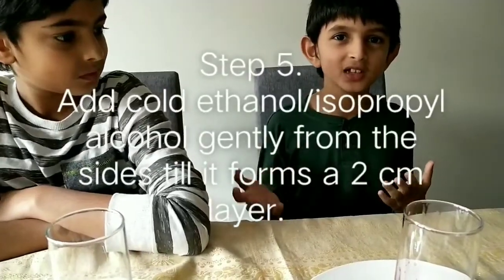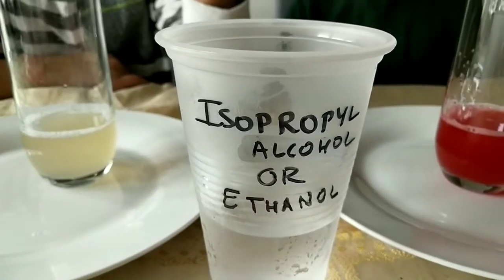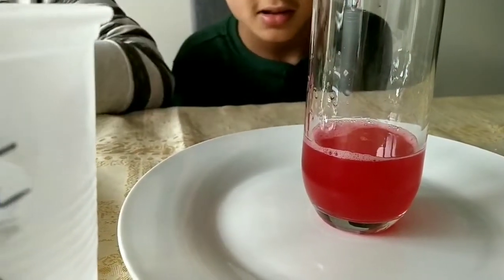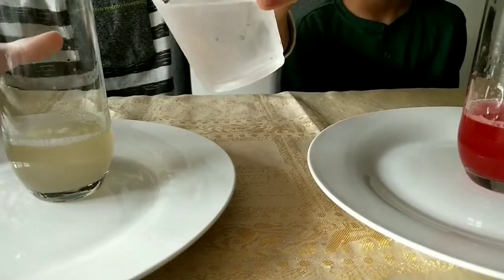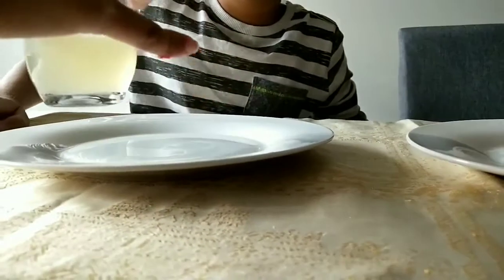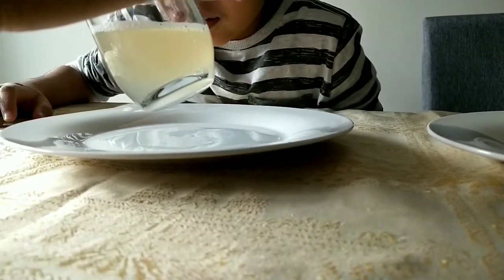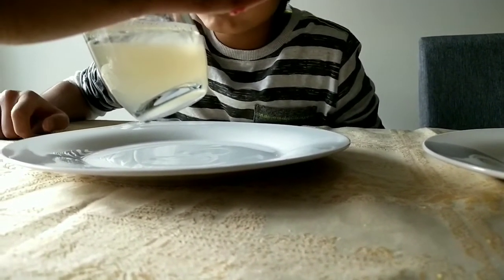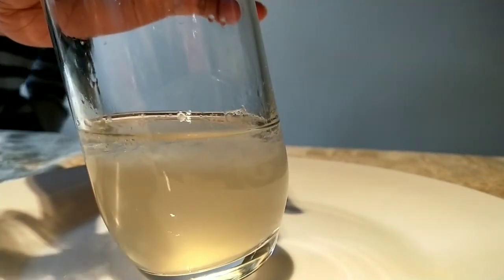Now we've finished filtering. Here's our ethanol — you can use either isopropyl alcohol or ethanol. DNA clumps are soluble, which means they can be dissolved in some liquids, but not in alcohol. So adding alcohol helps the clumps of DNA to form. You've got to be very careful when you pour it — pour it from the side. We're going to be adding about two centimeters of ethanol. Let's see what happens.